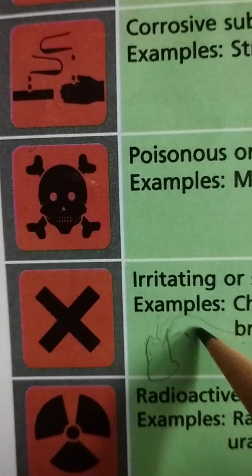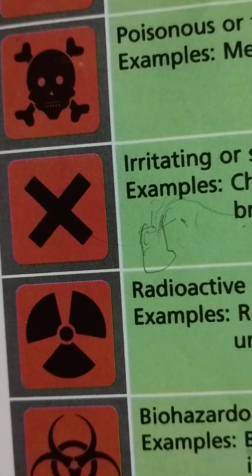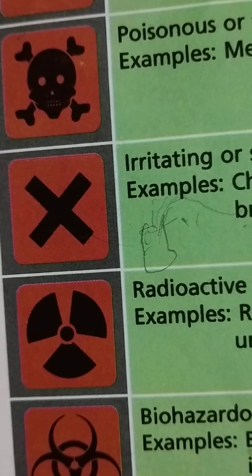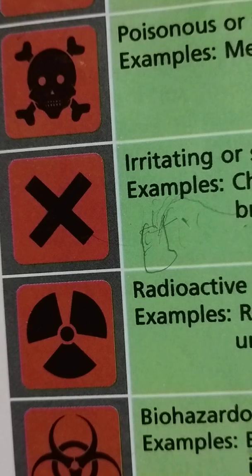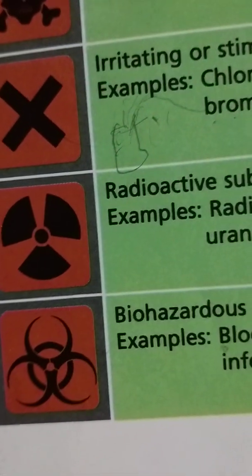The next symbol is used for radioactive substances. Radioactive substances are those which naturally decay or decompose. Nuclear reactions occur in radioactive substances and they can ionize chemicals within the body. All radioactive substances can cause cancer. Therefore, strictly follow safety precautions when handling radioactive substances.